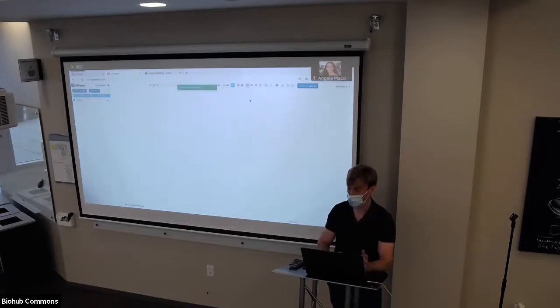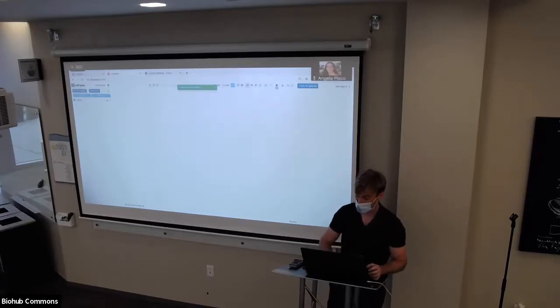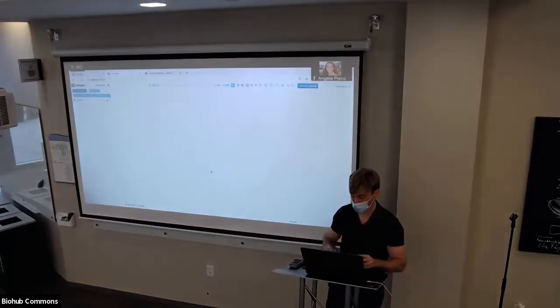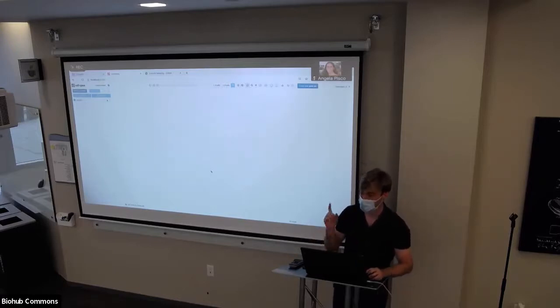At this stage, we still have no dimensionality reduction done. So what we do is we click the button to the right of it, which has a tooltip that says click to recompute your UMAP embedding. And then we're just going to hit run. We're not going to worry about all the knobs yet. Oh, and at any time, if you have any questions, let me know. I don't have access to the Zoom chat, so if someone's asking, just let me know.